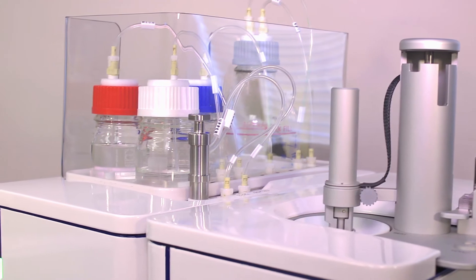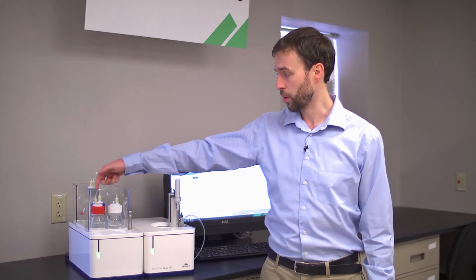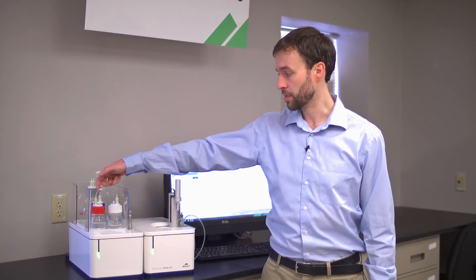Let me show you the new integrated washing module that offers self-contained reagent bottles, clearly labeled tubing with quick disconnect fittings, and liquid sensors to alert you if a reagent bottle is running low.